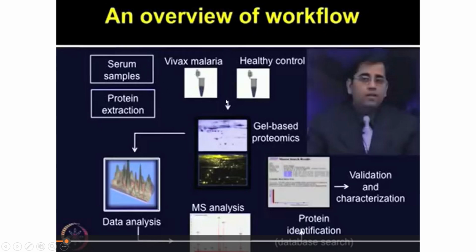So you will do all those analyses, then you'll get the gel, right? Like you will take this sample, run IPG, isoelectric focusing, then you will run the SDS-PAGE. Once that is done, you will stain the gel. After staining, you'll get the gel of separated proteins. Then you can take one specific band or one specific protein for doing MS analysis, etc., and identify which protein, and accordingly that specific protein can be validated and characterized as well. So this is a short overview of each and everything.